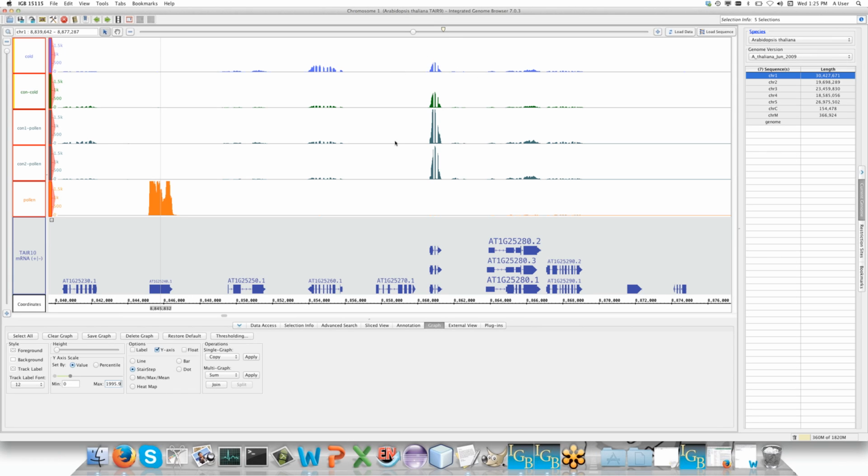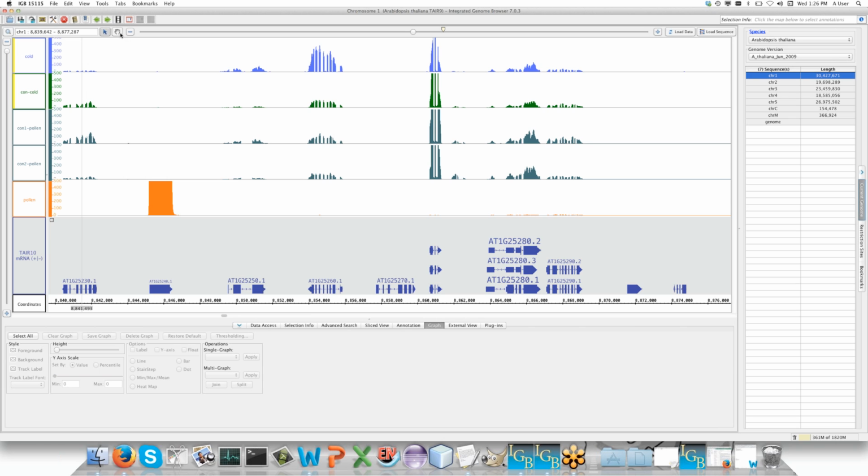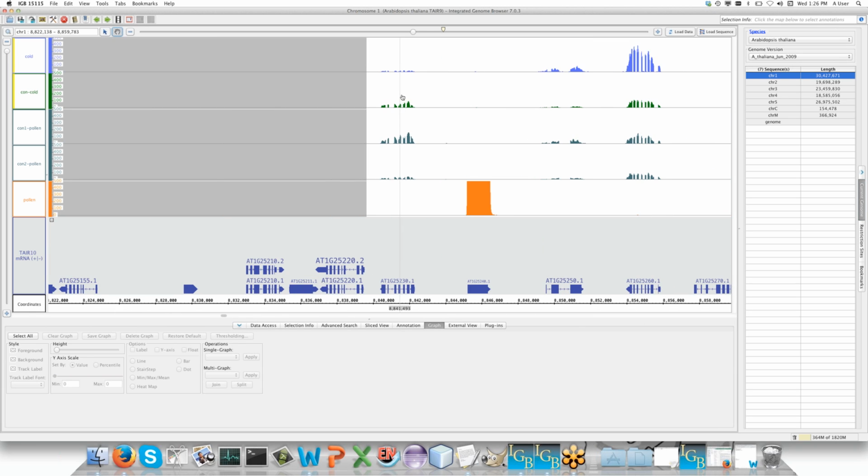And you can see, as opposed to the first time we saw it, it looks like cold might actually suppress this gene rather than allow it to be expressed at equivalent values. And again, I can further reduce the number to 500. And here we can see this gene certainly seems to be enhanced in cold, and we can even begin to see that pollen may make a rather minuscule but still present amount of these genes. So there's some other still biological concerns, and I'm going to look at this gene first to demonstrate it.